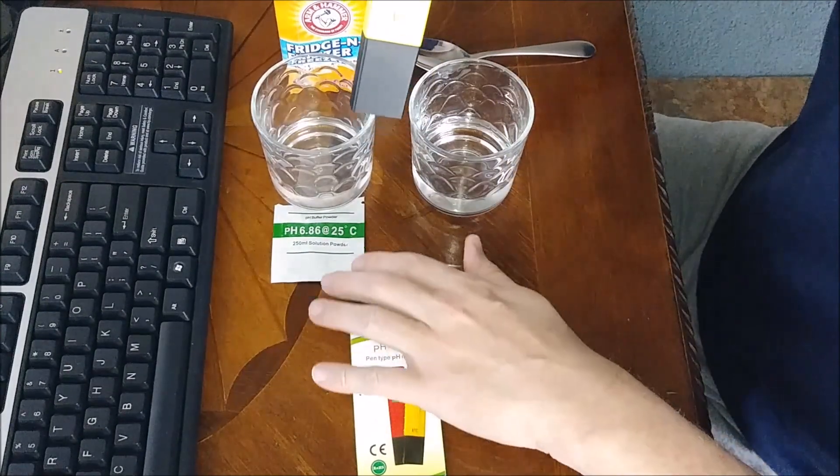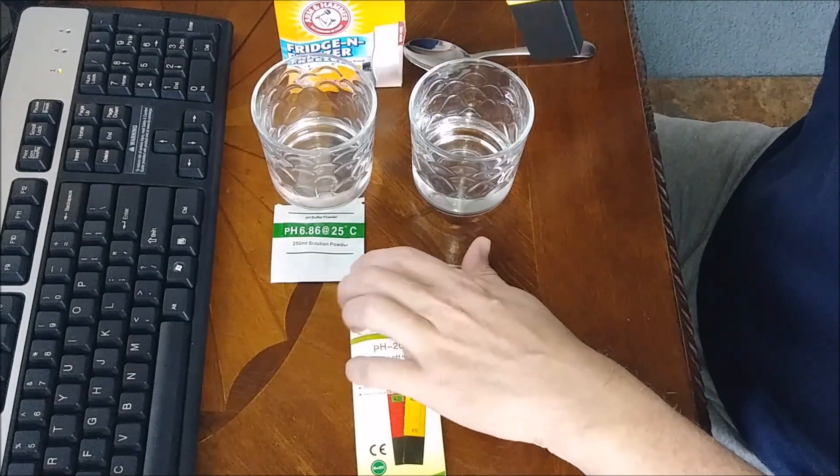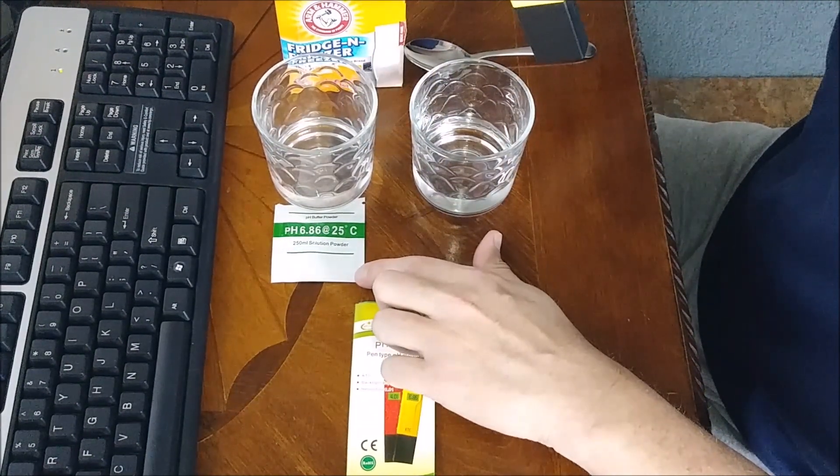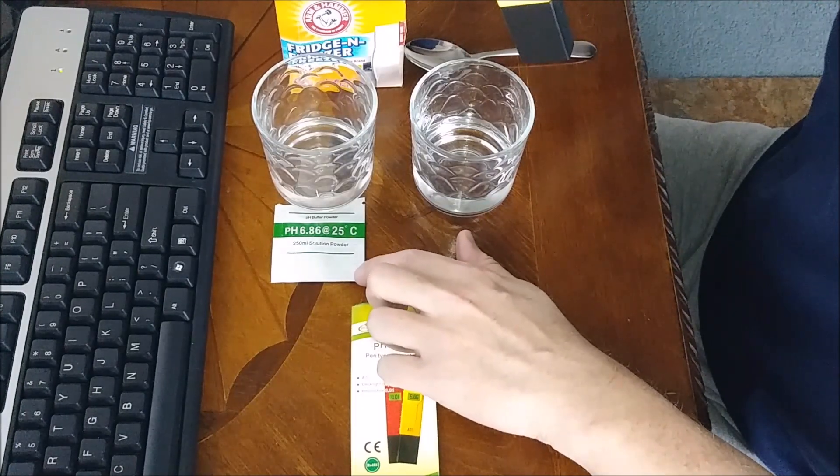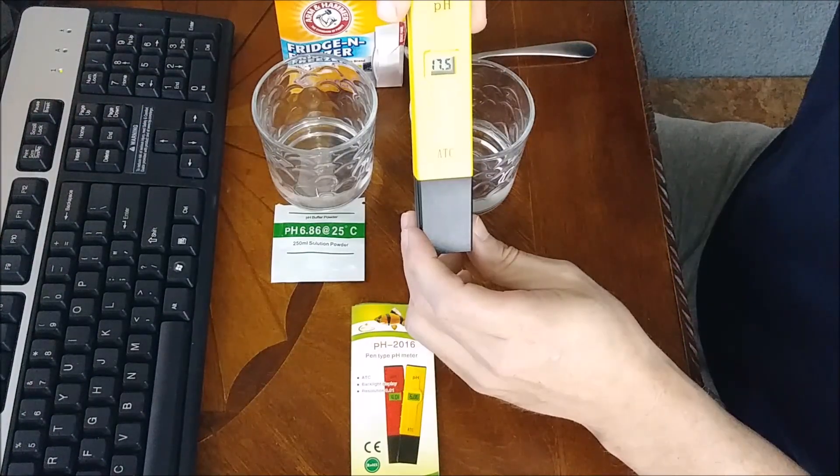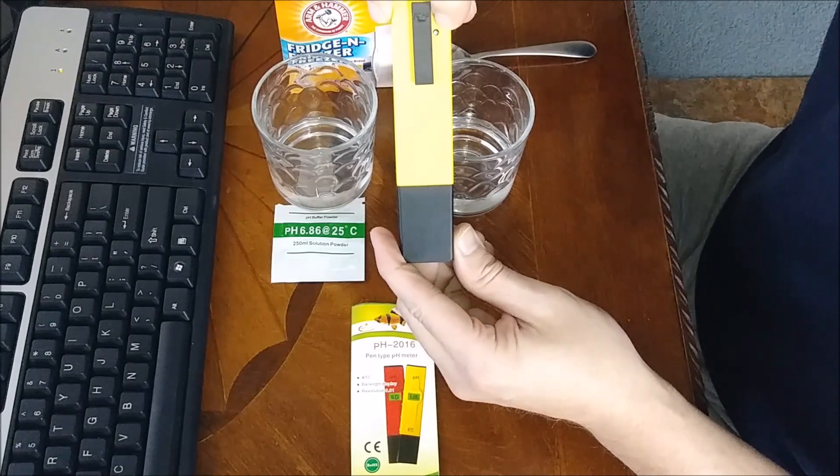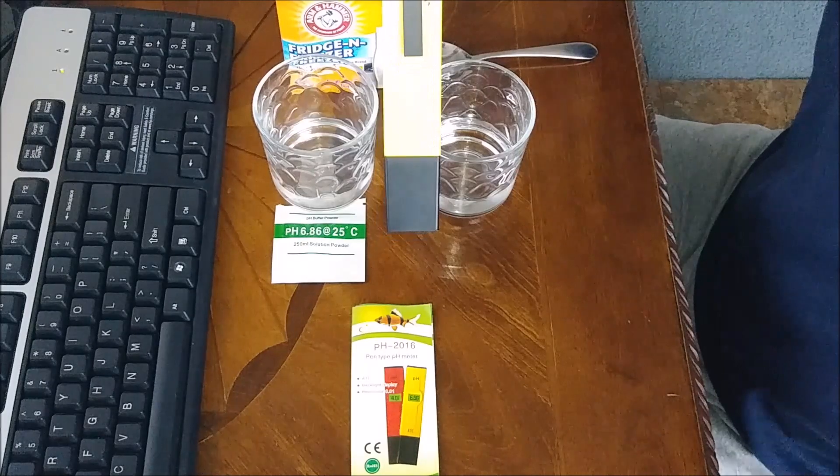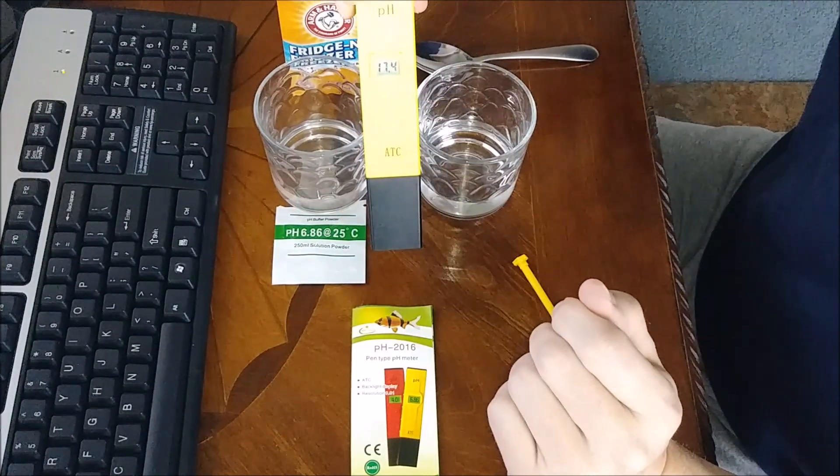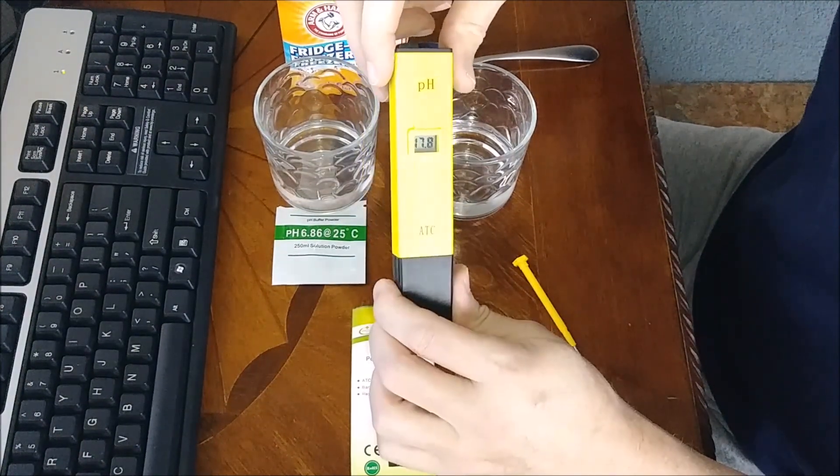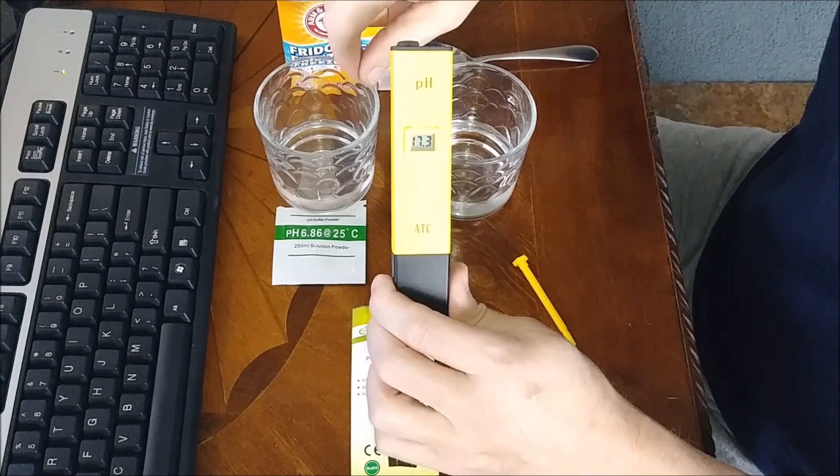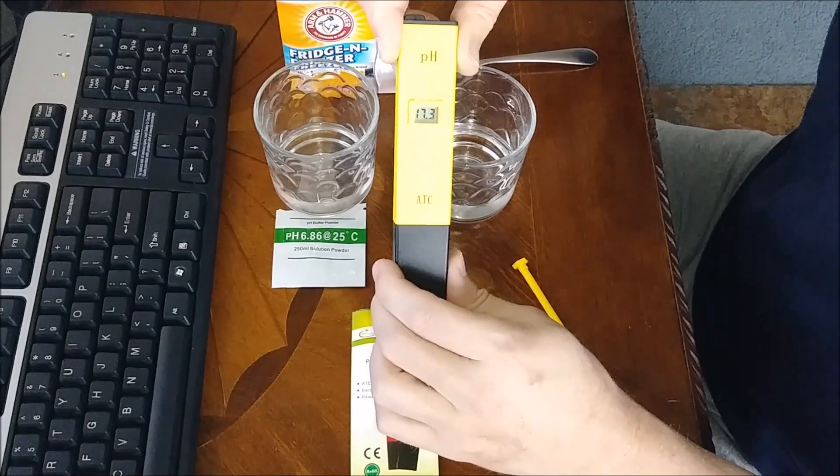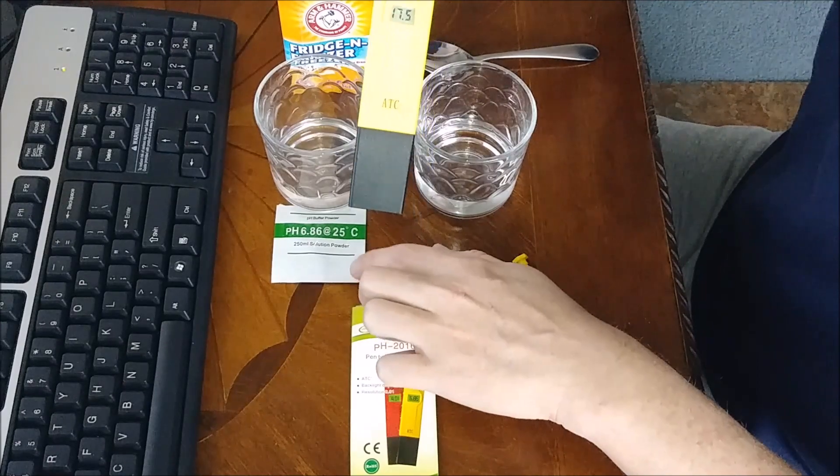Usually when you buy these, they will come with a solution in a little package that's already pH'd to 6.86, and that's how you set up your tester. It's got a little adjustment screw right there and also comes with a screwdriver with the kit. I think this was around $15 to $18. I'm going to go ahead and calibrate it per the manufacturer's instructions with their pre-pH package.